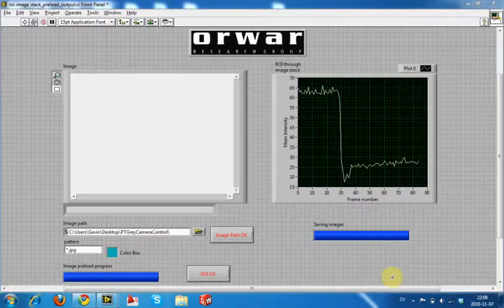The only difference between this ROI analysis in the extra section and the ROI analysis that we worked on is that there's real-time feedback, and that's achieved through preloading the images. We may not work on this one, and we may use the one that you built in session 2. This one helps illustrate some of the flows a little bit better, but we'll see in the session which one people feel more comfortable with.